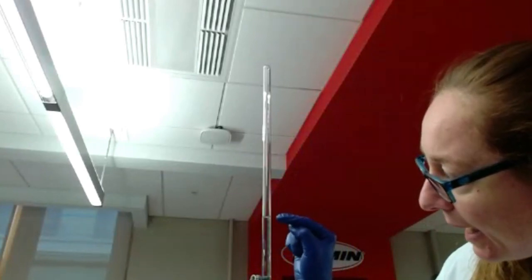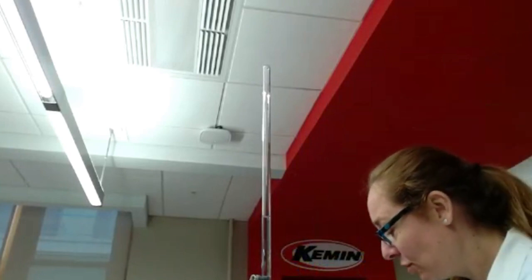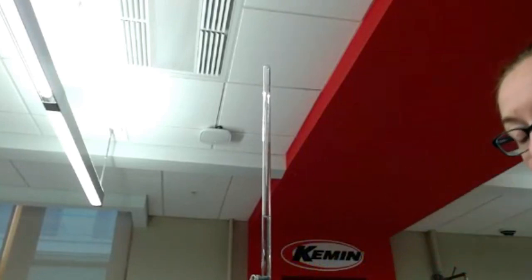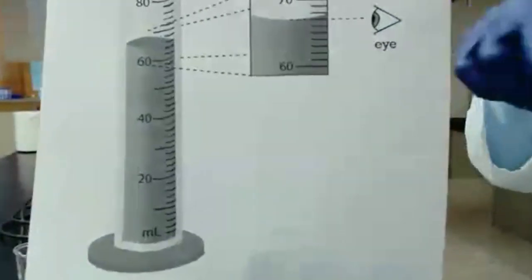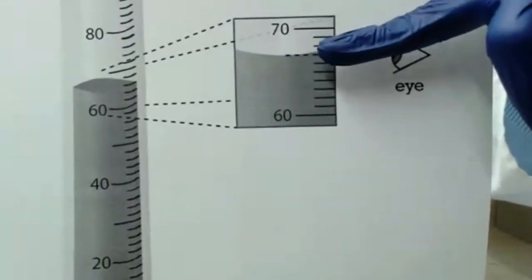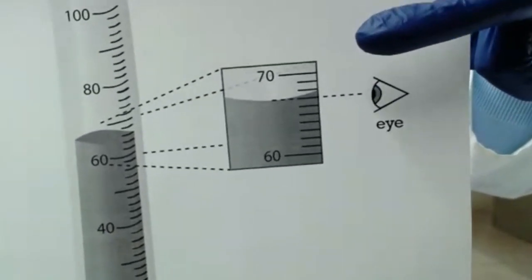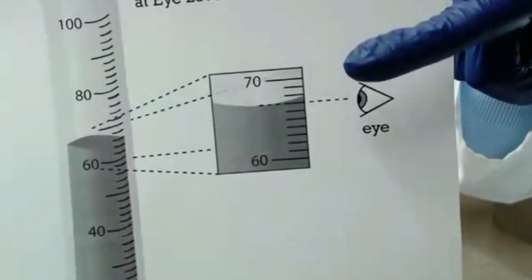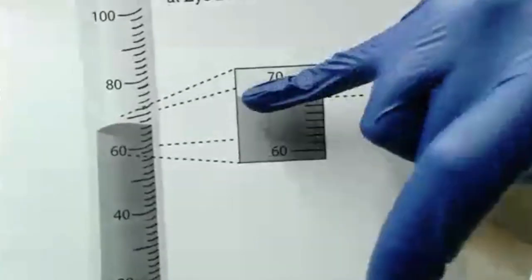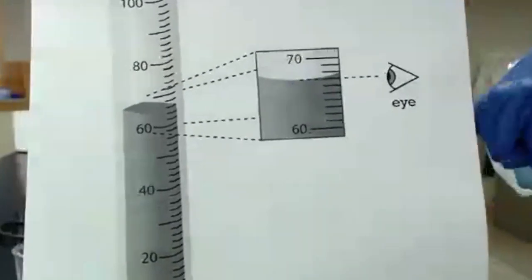And so I have a specific level, and that's where we will be able to look. That's what I was explaining earlier. To evaluate the volume you have in your burette, you have to look at the same level. Your eye should be at the same level as the bottom of that shape. For accuracy, you look in the middle, at the bottom.